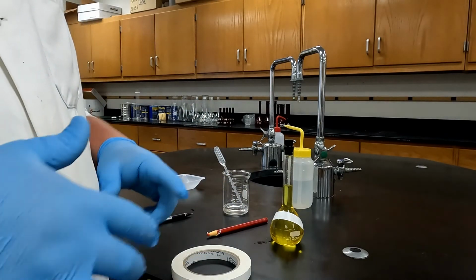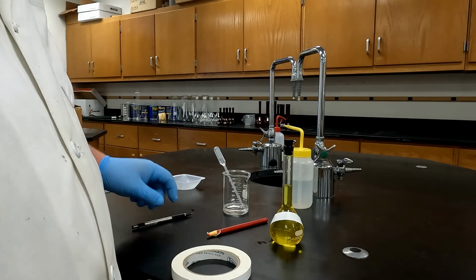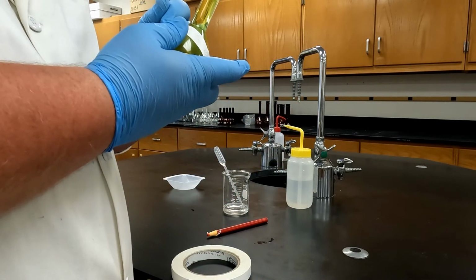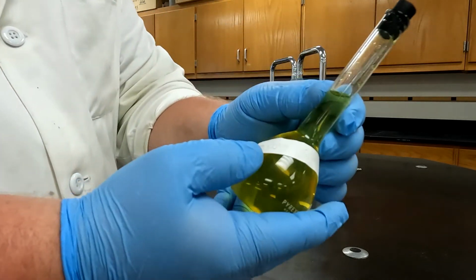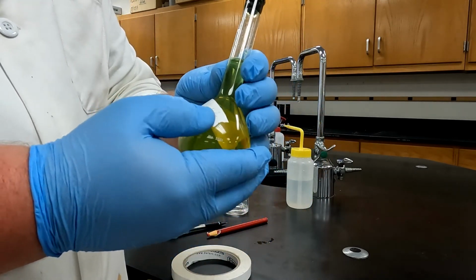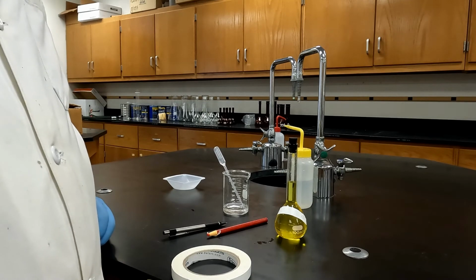I stick it to the flask, careful not to rub my fingers along it and rub off the pencil markings. However, it's very difficult to write in pen on this labeling tape. So once it is labeled, again, you have concentration, formula, date it was made, and initials. You have your solution ready to go.